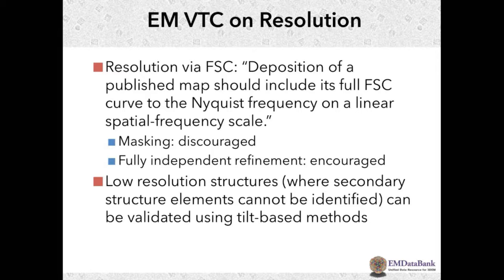crystallographers mean it. And in terms of the shape, that's also reflective of that, because it's probably reflective of your data, but in terms of what number you want to extract out of that, that depends on what your question is. Because if, let's say, I say this is 14 angstrom resolution, but it answers hydrogen bonding questions, then you know how inaccurate that number really is.